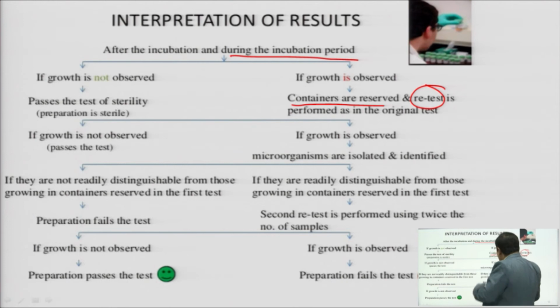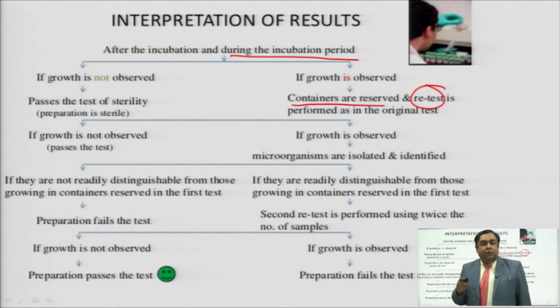But if there is growth observed during the retest, try to identify the microorganism. If the microorganism of the retest matches with the original one, the preparation fails to pass the sterility test.